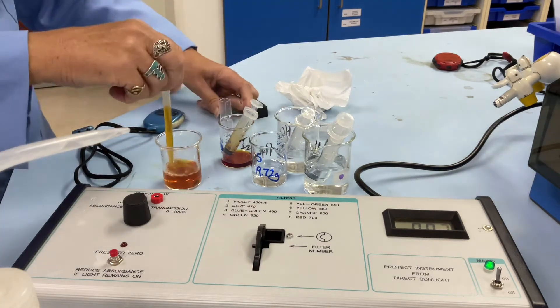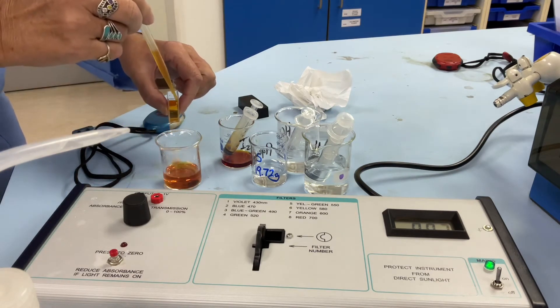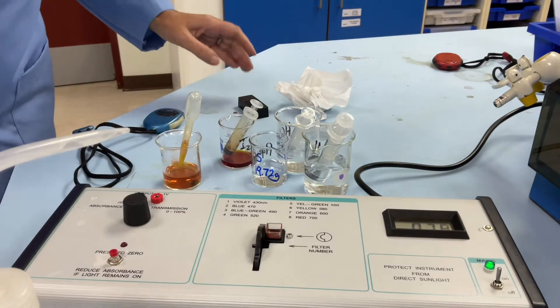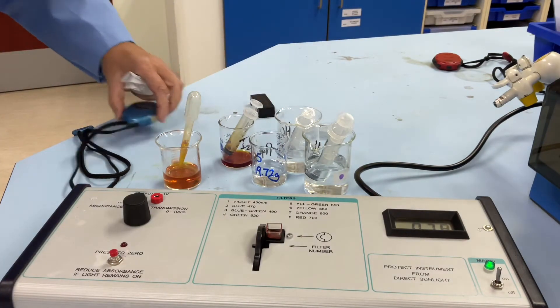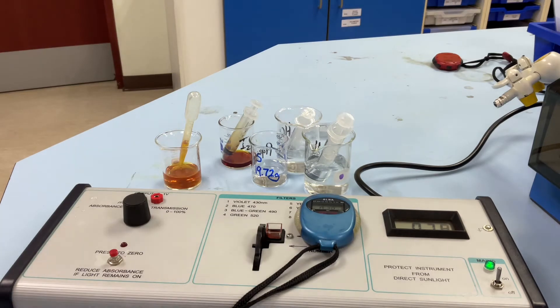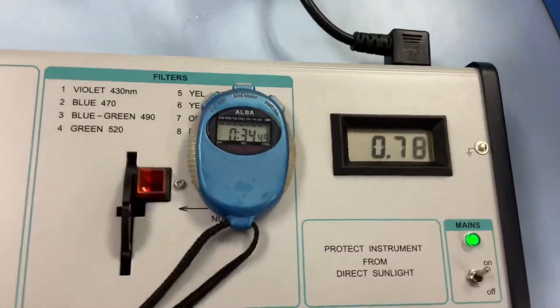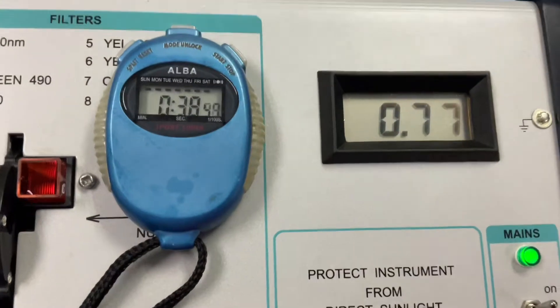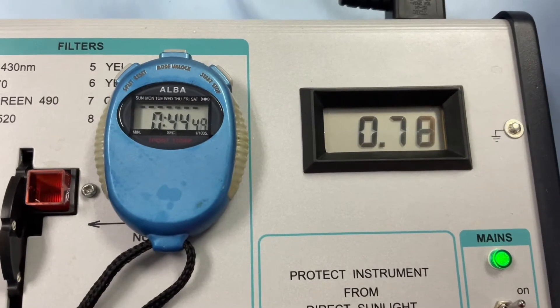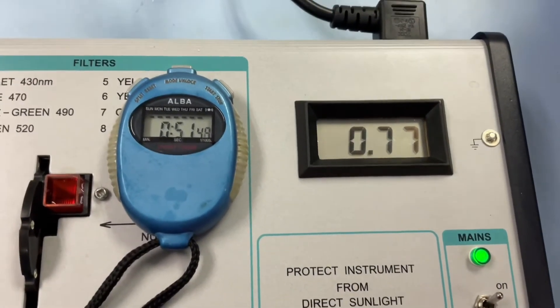Mix it round, and then I'm going to pop that into my cuvette again. The reaction is going to happen inside the cuvette, so pop that back in there and start taking readings. The absorbance is 0.78. I'm just going to continuously monitor this — we can take readings every 30 seconds and then start to plot a graph.